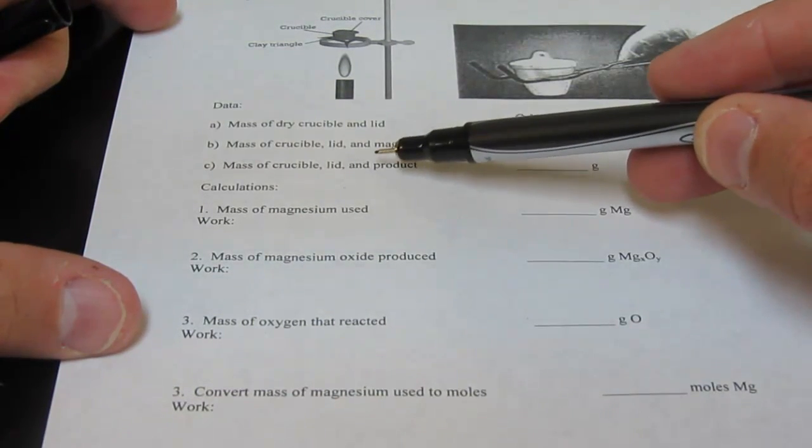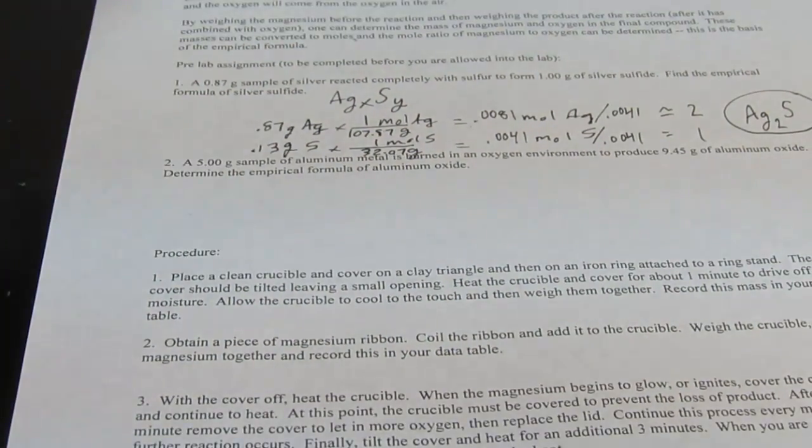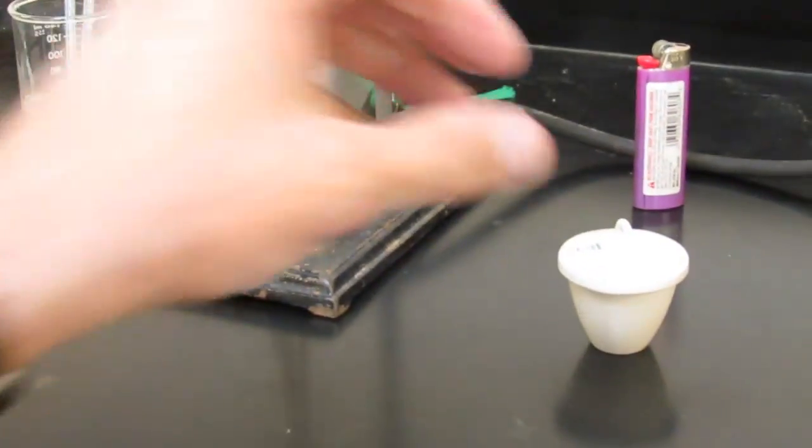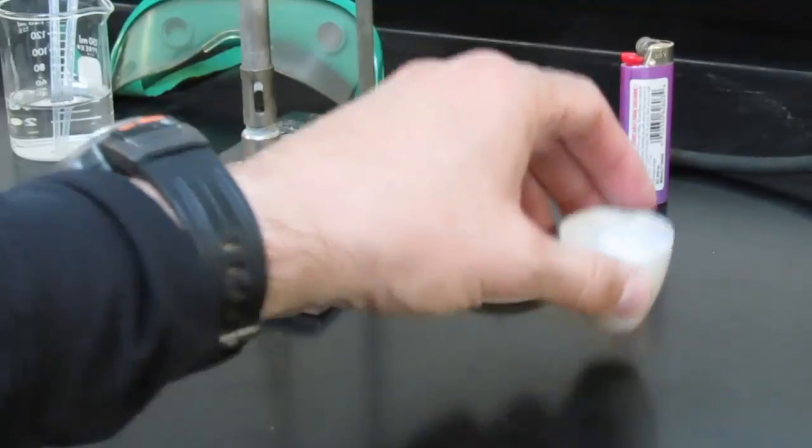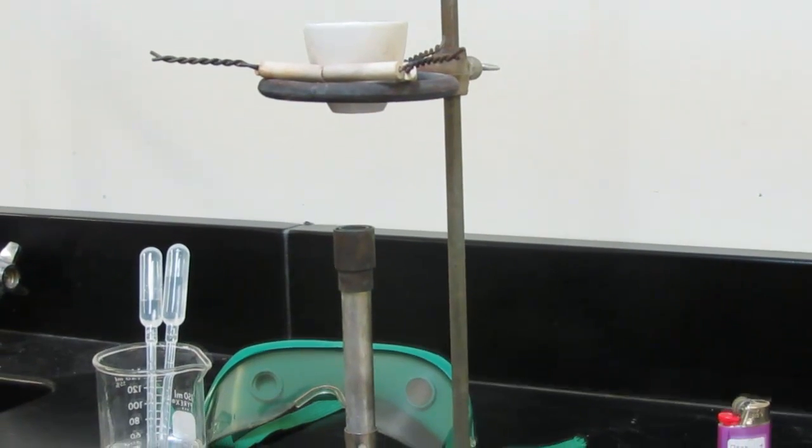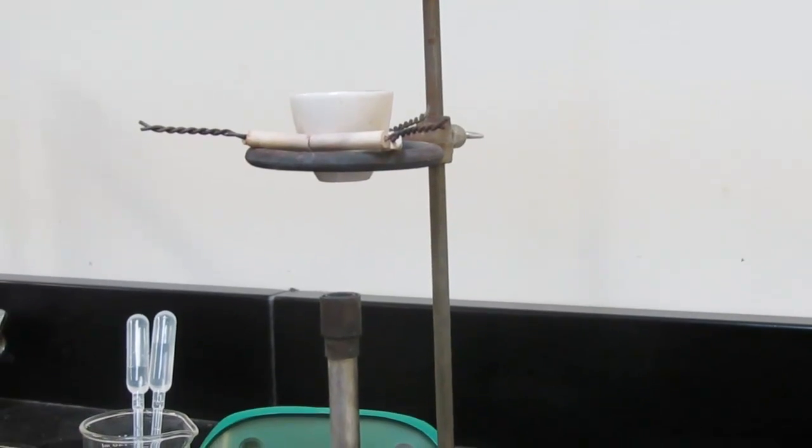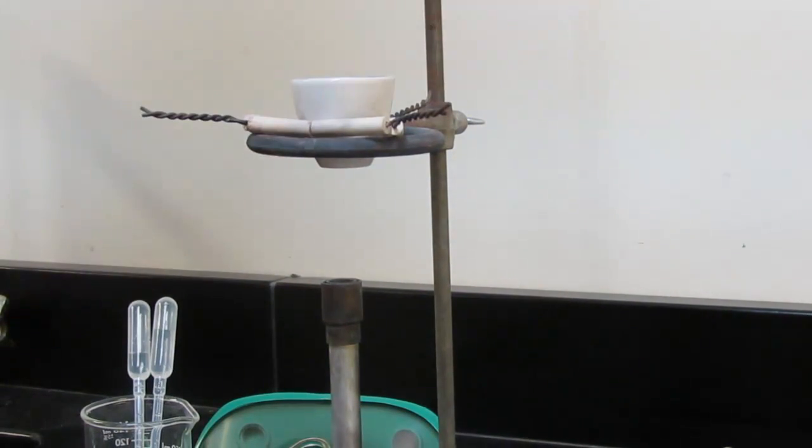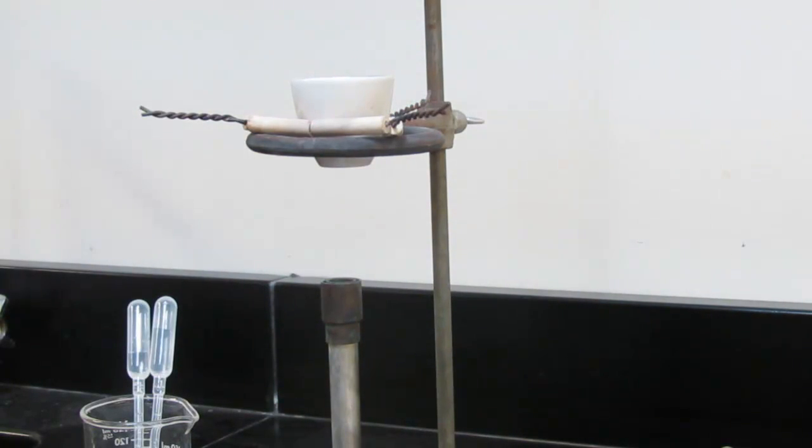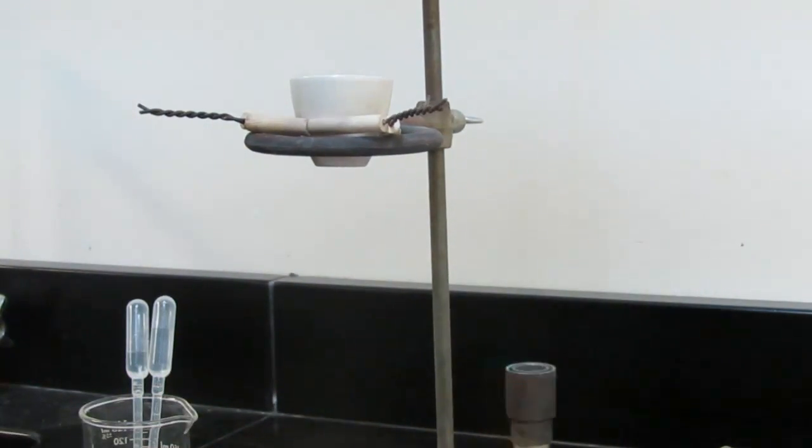Now before we can find the mass of the crucible lid and product, we have to perform the experiment. We have to react the magnesium with the oxygen. So what we're going to do is we're going to place this with the lid off on our clay triangle. So you'll see we'll take our lid off, place the crucible on our clay triangle, and we'll then go ahead and light this. We'll try to take the camera off in just a second so you guys can see what it looks like from the top. So you guys will wear your safety glasses. Make sure you put those on. We'll light our Bunsen burner.